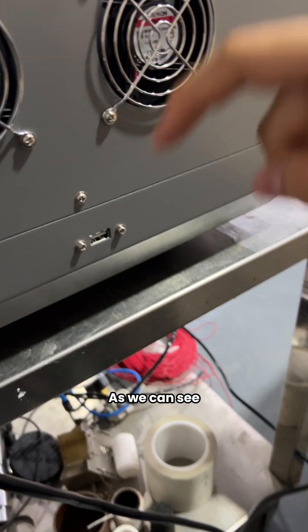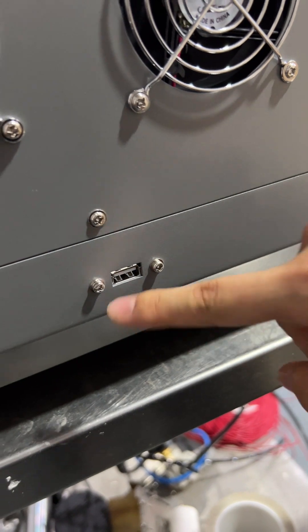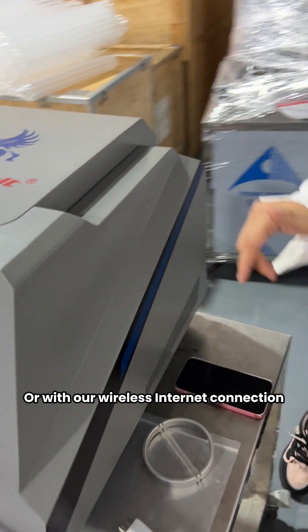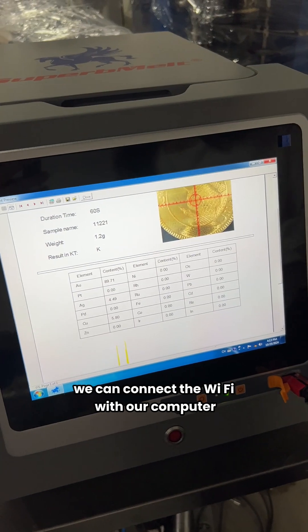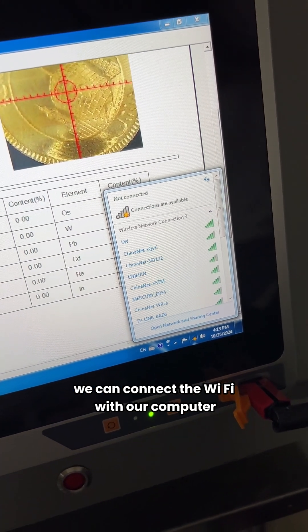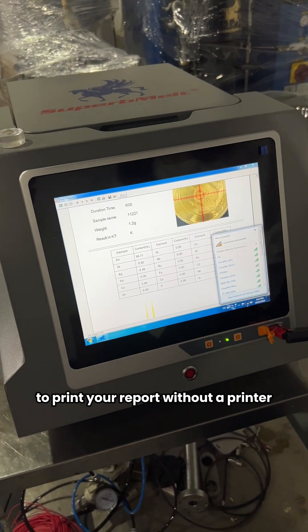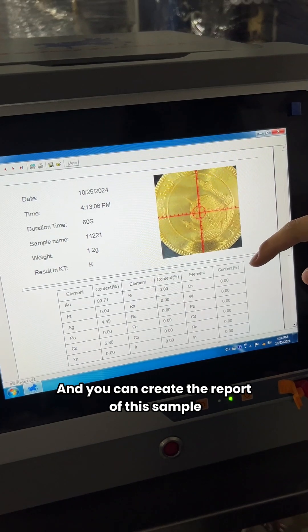As we can see on the back of the machine, there is a USB input. You can connect it to a printer, or through our wireless internet connection, connect the Wi-Fi to your computer so you can do wireless printing to print your report without a physical printer. The testing is now over and you can print the record of this sample.